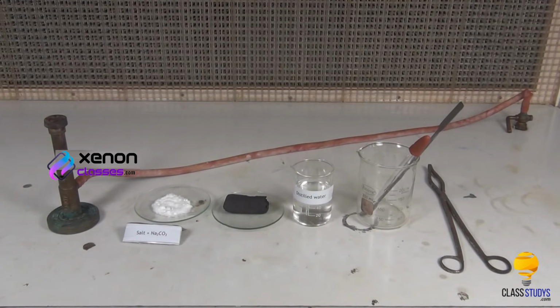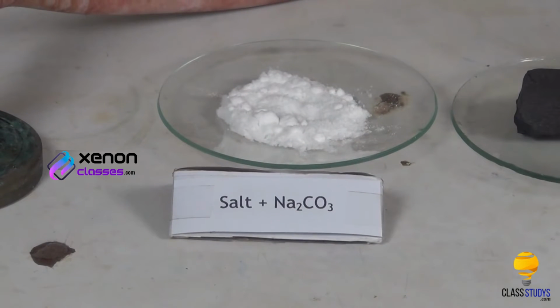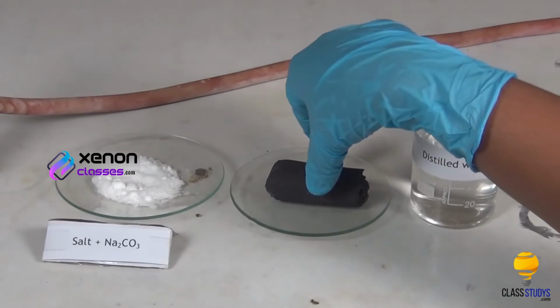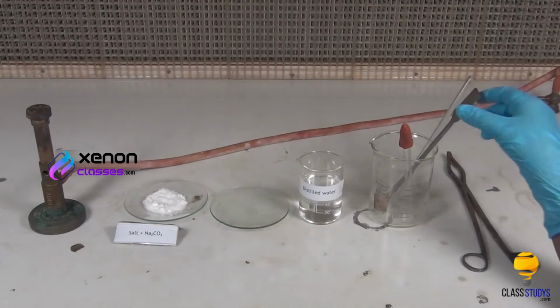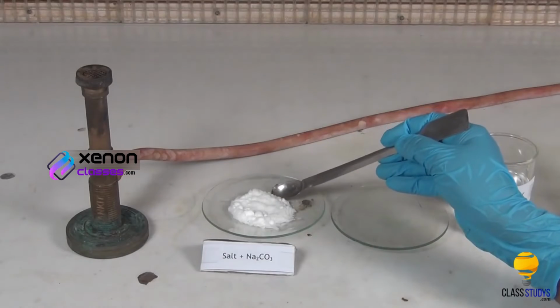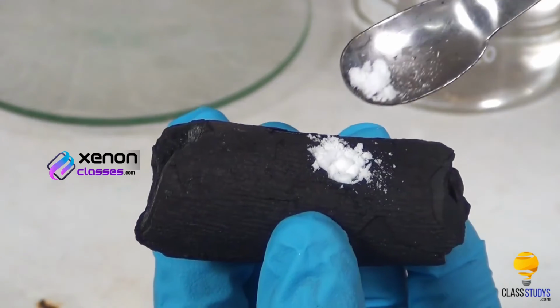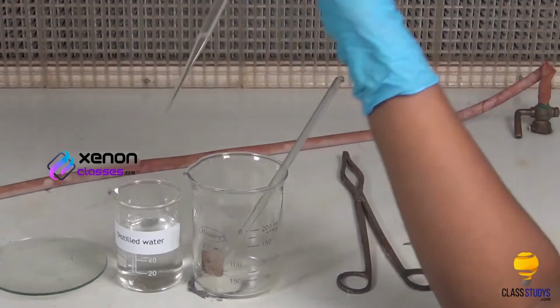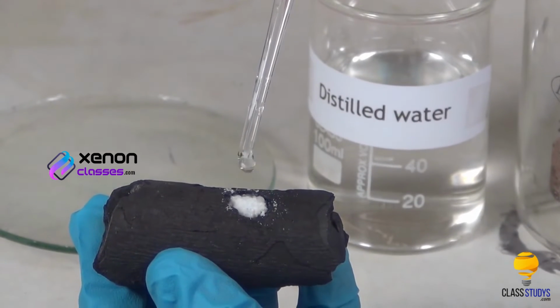Procedure: take a mixture of a small quantity of salt and double its quantity of sodium carbonate in a watch glass. Take a charcoal piece with a small cavity in it. Using a spatula, place a small quantity of the mixture in the cavity of the charcoal piece. Using a dropper, add a few drops of distilled water to the mixture to moisten it.